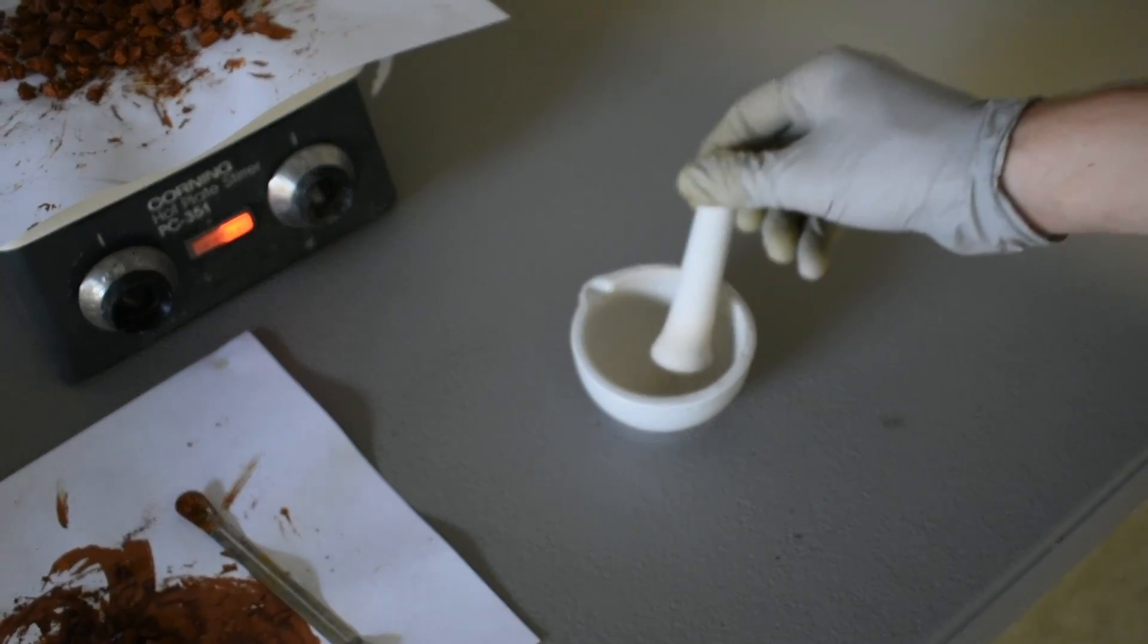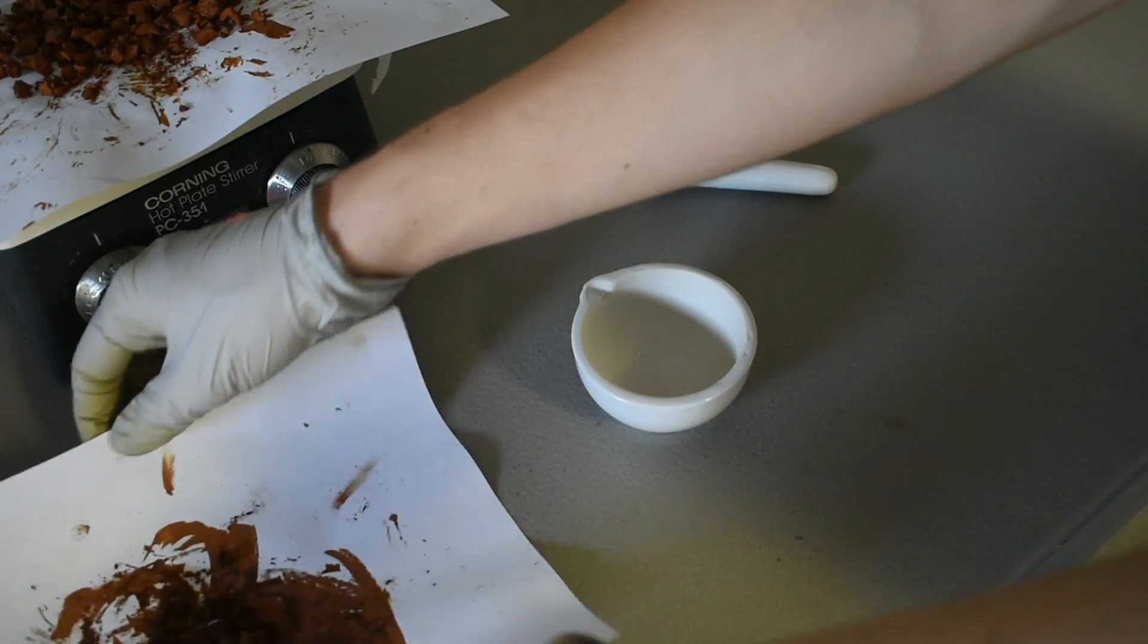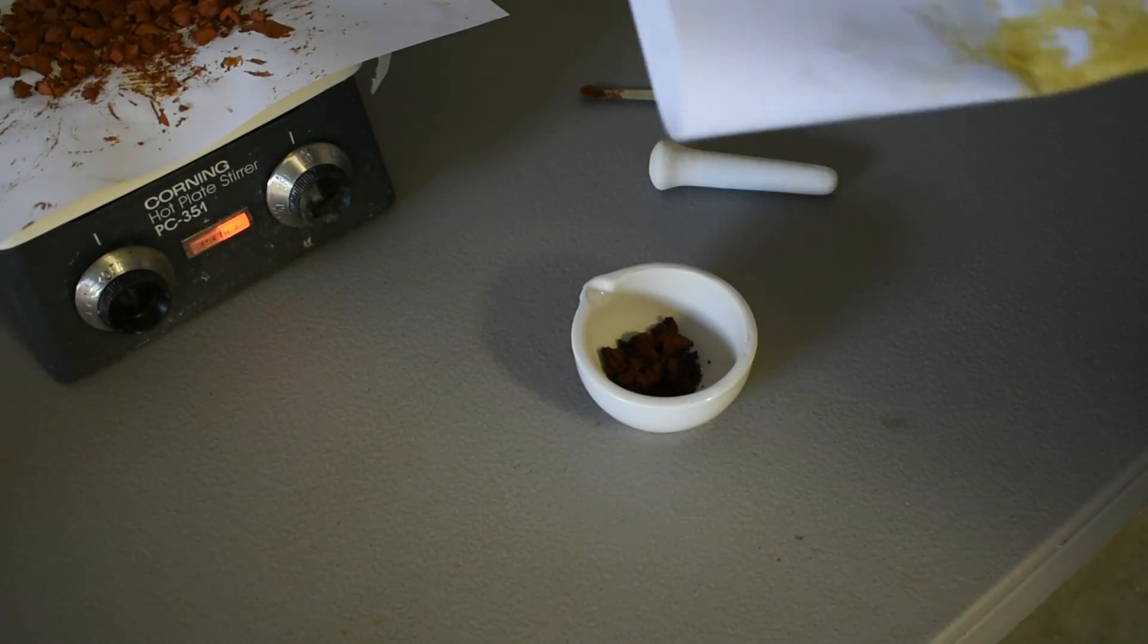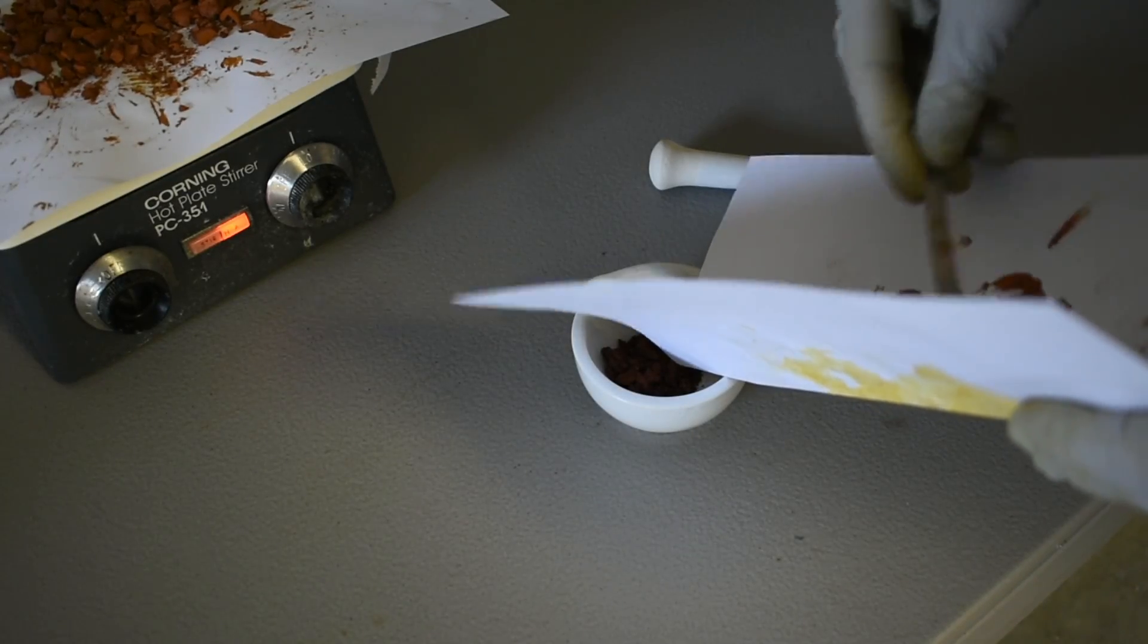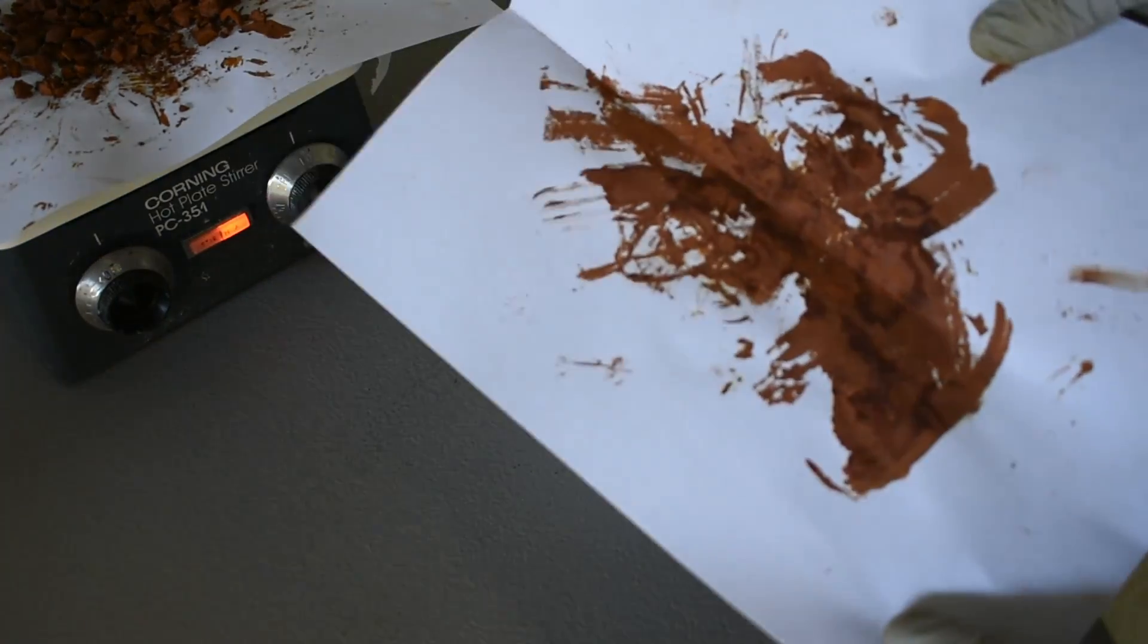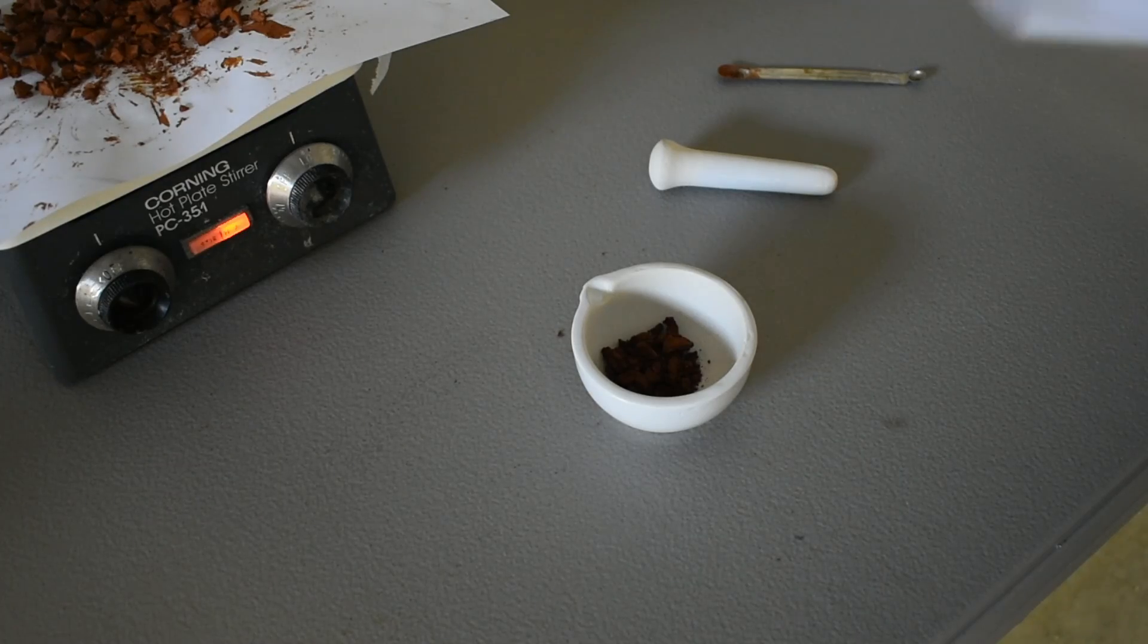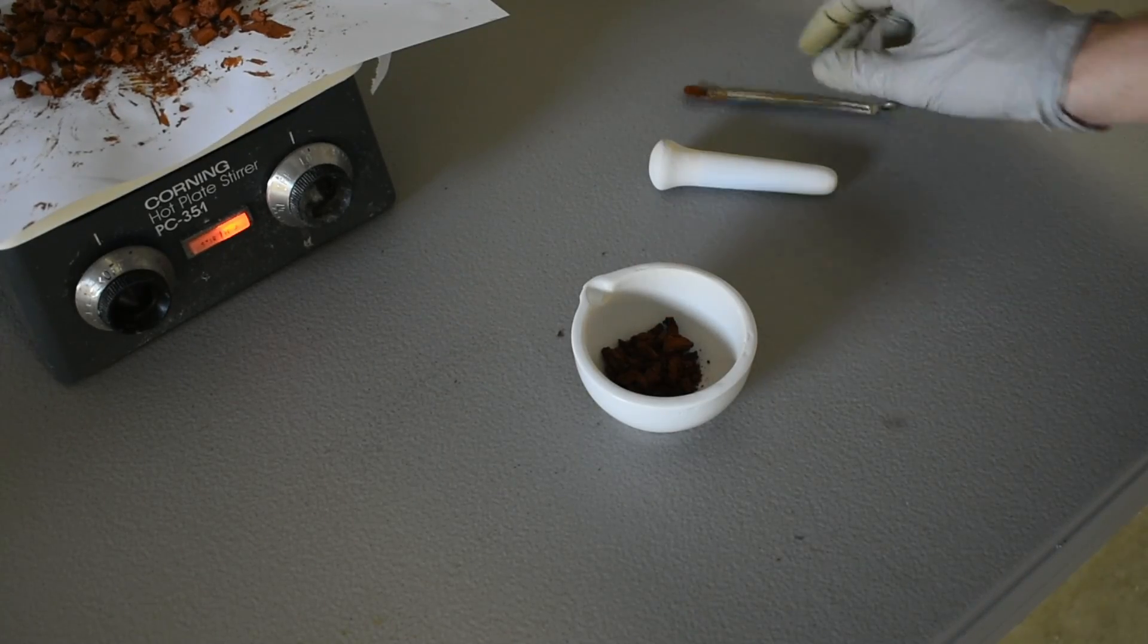Alright, we got our fresh, clean mortar and pestle. I'm just going to pour some of our product in here. Make sure you dispose of this properly. Chromium heavy metal, toxic. You cannot just throw it away. Make sure you neutralize it with something like sodium metabisulfite. So I'll just put this over in my waste area, and we can get to crushing.